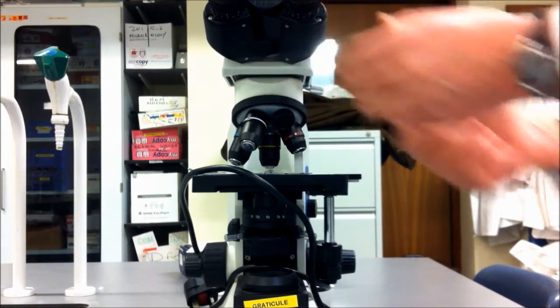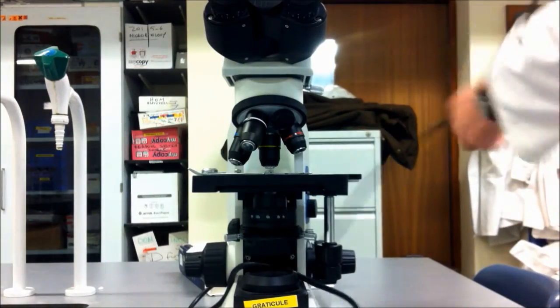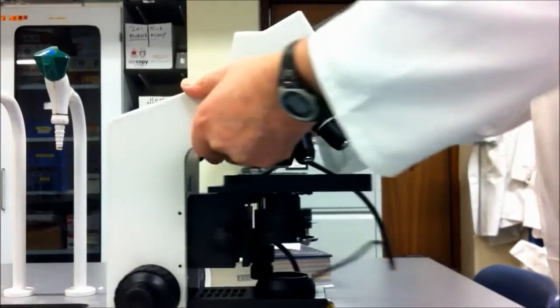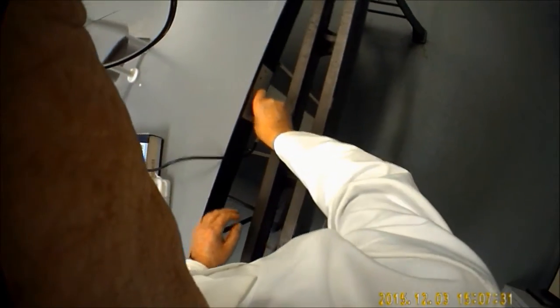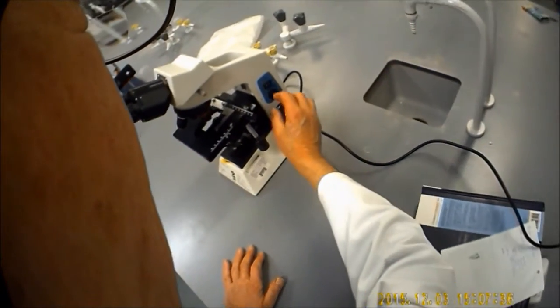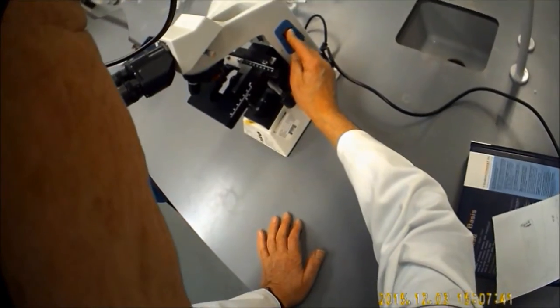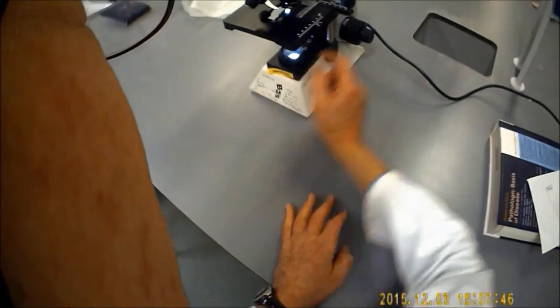We'll unspool the lead and plug that in. On the side of the microscope is the on-off switch. That will turn the light on, which is underneath the stage. You can turn the strength of the light up and down by rotating the knob just below the switch.